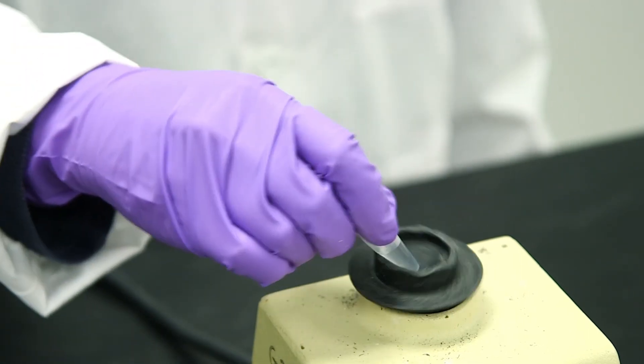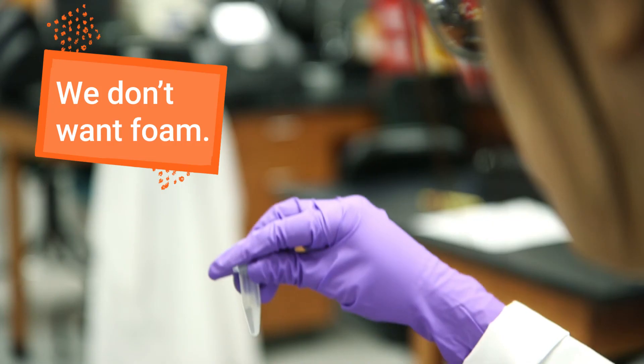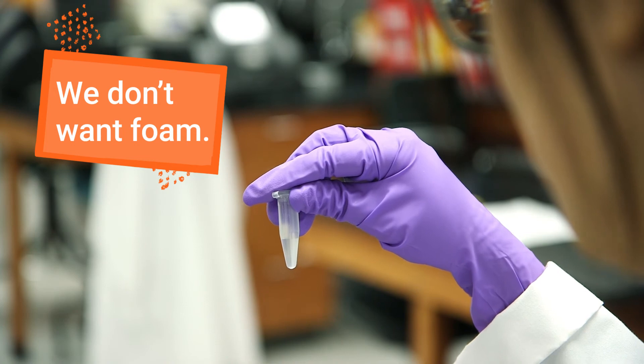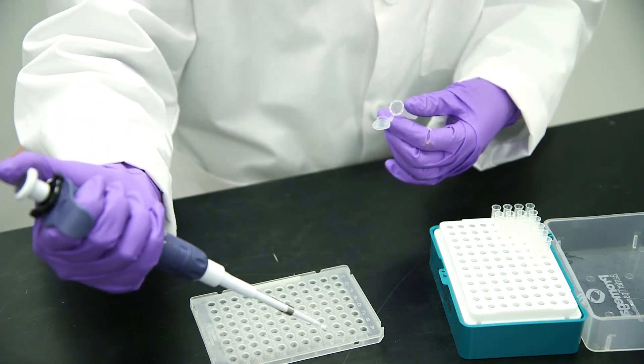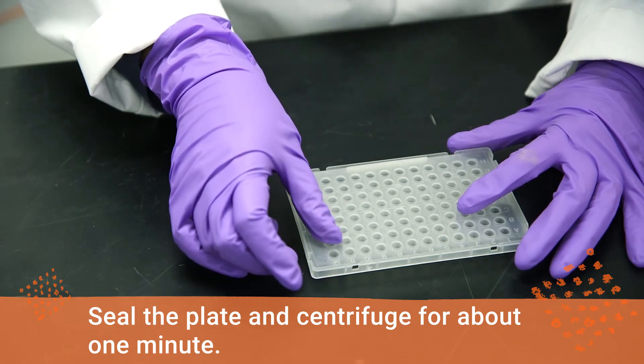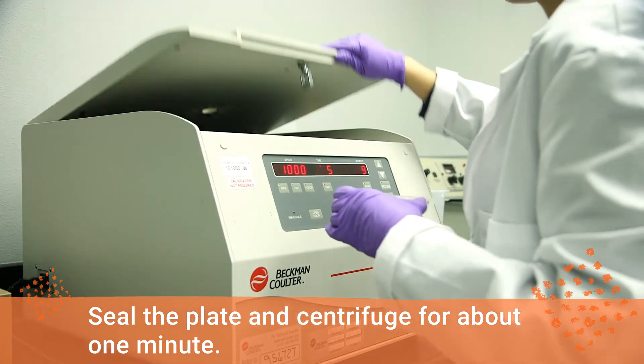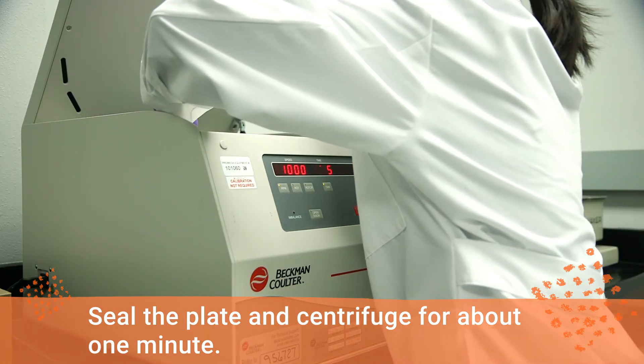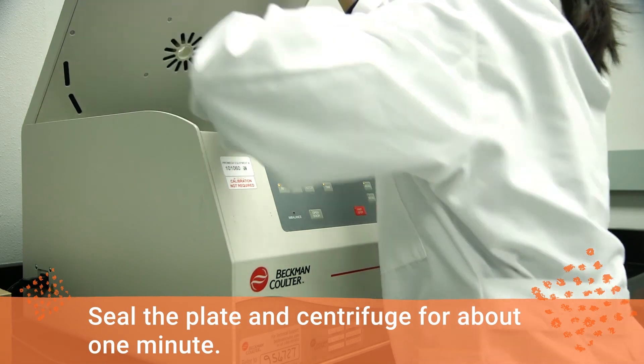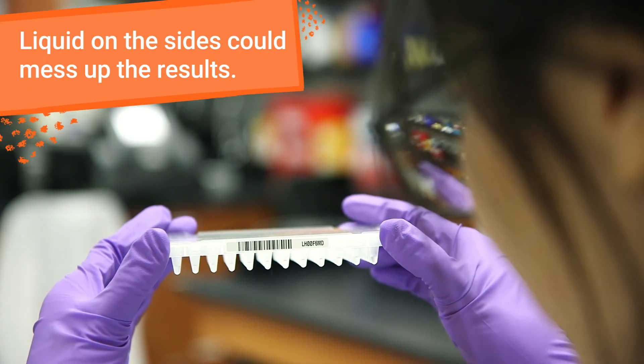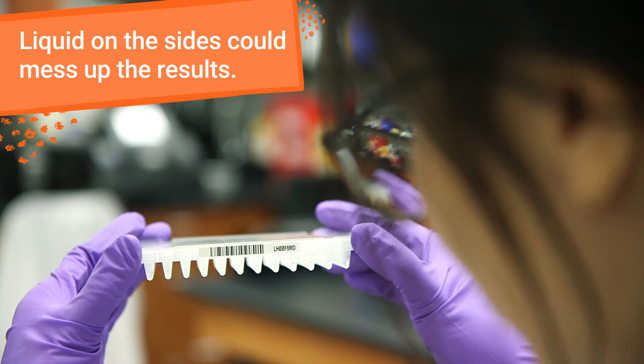Gently vortex the tube to make sure it's fully mixed. Make sure it doesn't foam. Carefully add reaction mix to each well. Seal the plate and centrifuge it at a low speed for about one minute to make sure all the reagents and sample go to the bottom of the wells. If liquid stays on the side of the well, it could mess up your results.